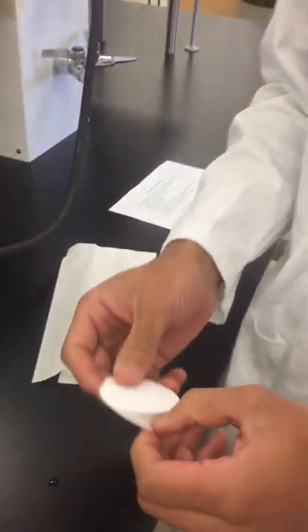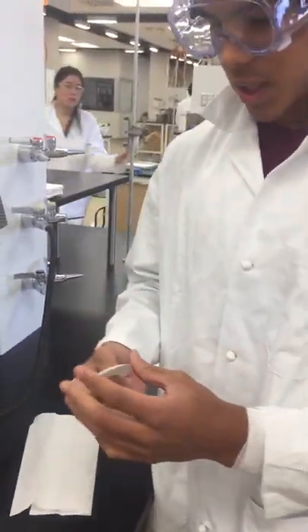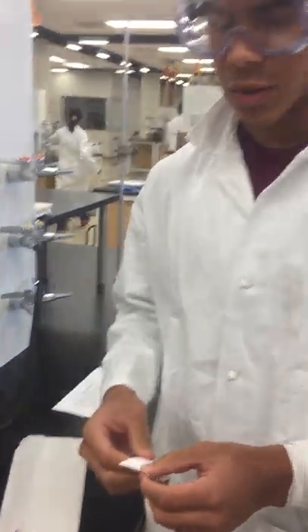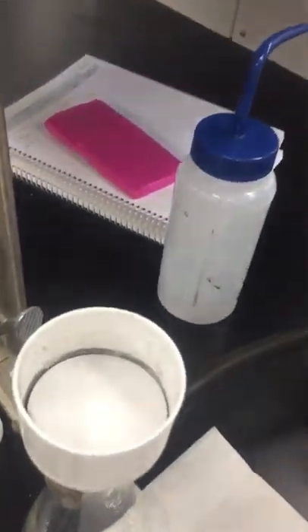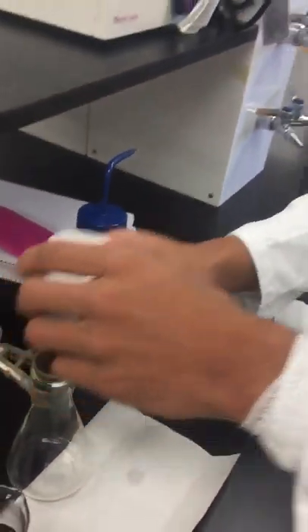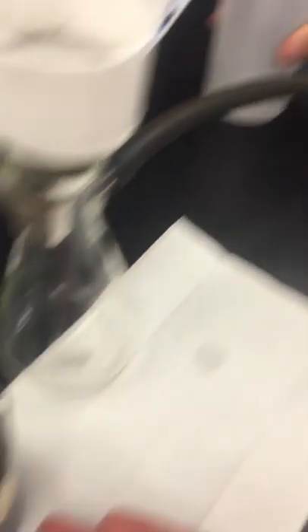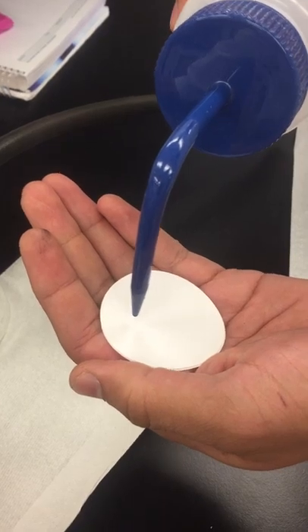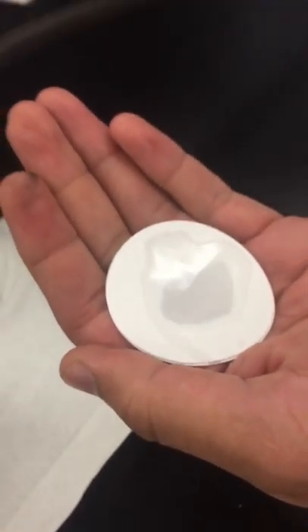Before we start the filtration process, we're going to need to grab the filtration paper. These are key in order to get your precipitate to form on top of your filter. You're going to want to use two pieces. Before you just put it in, what you're going to want to do is wet it with your solvent. Our solution here is activated carbon with DI water, so we just take some DI water and simply wet it. It doesn't need to be soaking, just a little bit.